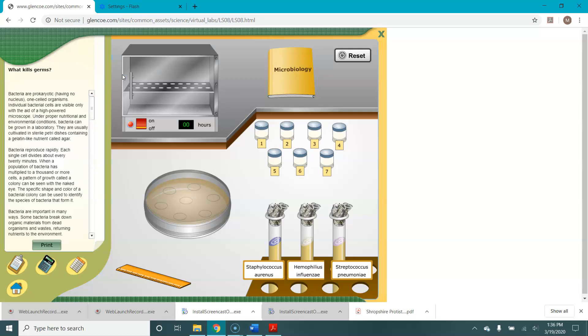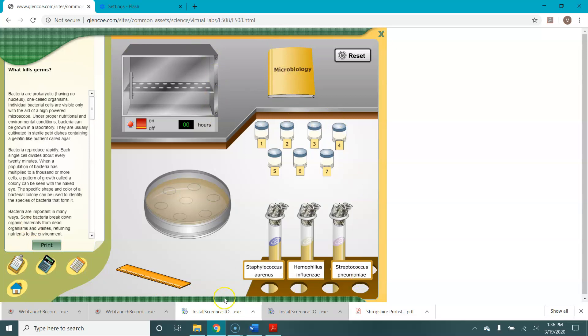Now I will tell you this lab is probably older than most of you are. It's got some typos in it so we are not going to use the information here or these tools down here. We're just going to use the lab tools so that you can simulate what it's like to do an experiment like this in the lab.